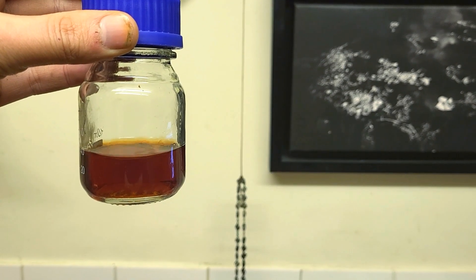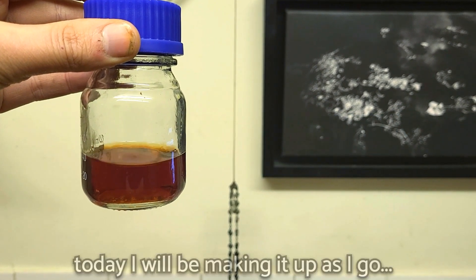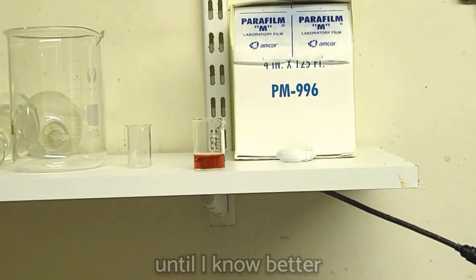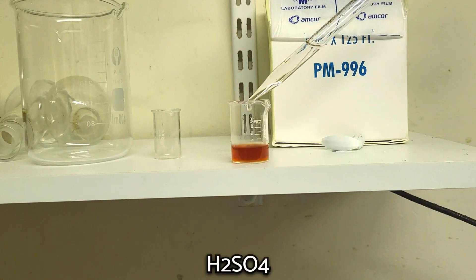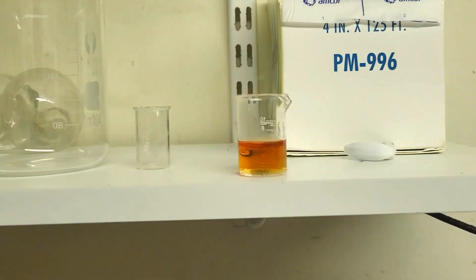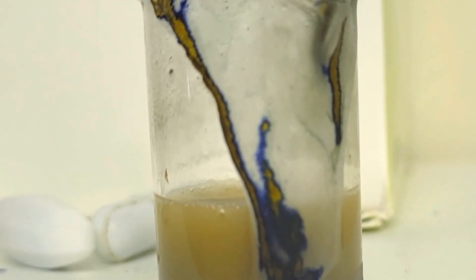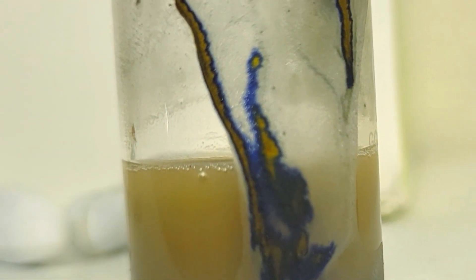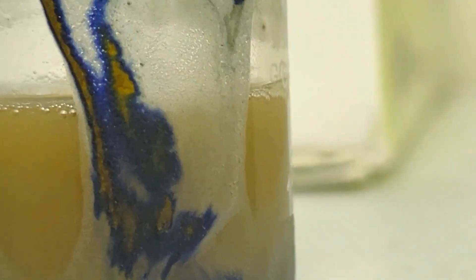Molybdenum oxide in nitric acid. I added some water when I noticed it had dissolved to form a red solution. On the shelf I have some molybdenum oxide dissolved in water, and I'm going to add some sulfuric acid. I just added some zinc and that has made this blue colour, which I think is molybdenum blue. That's a nice colour.